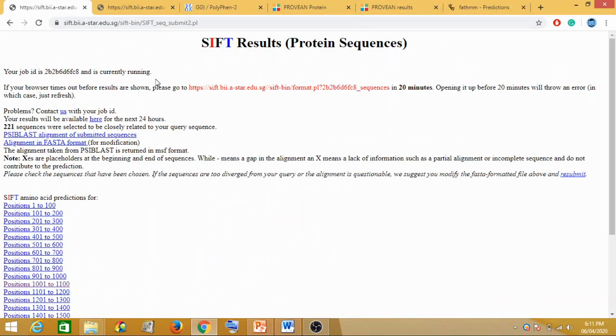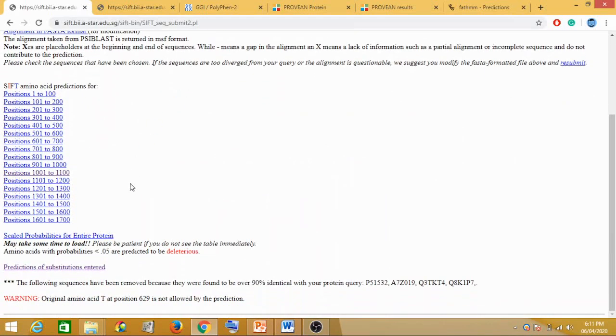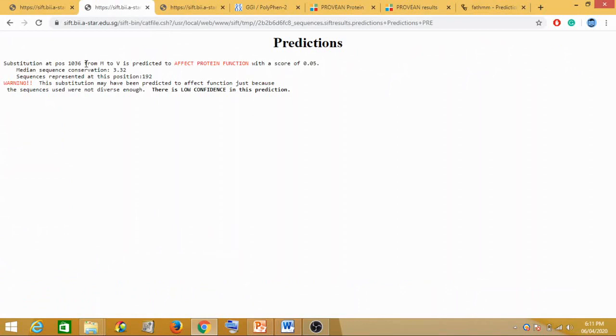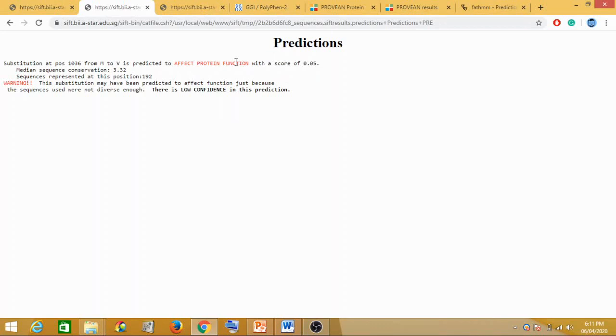If you look at predictions of the substitutions entered, if you click on this section, it shows substitution at position 1036 from methionine to valine is predicted to affect the protein function with a score of 0.05. So the score what we have obtained using SIFT is 0.05, and it is said to affect the protein function. That means using SIFT, the mutation analysis we have done is deleterious.